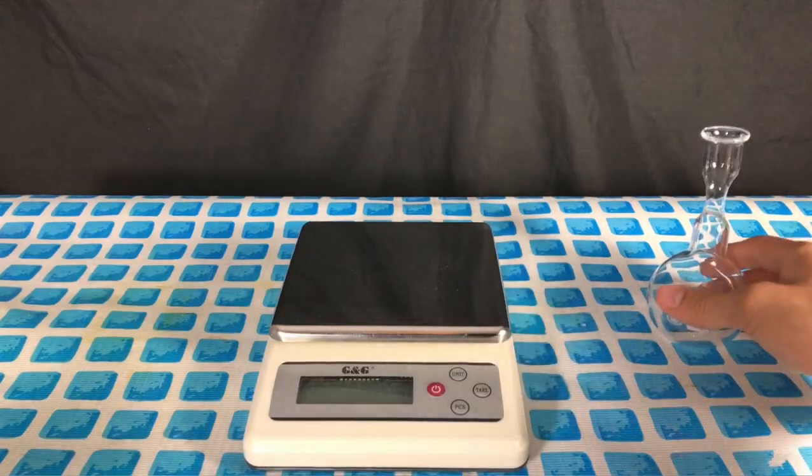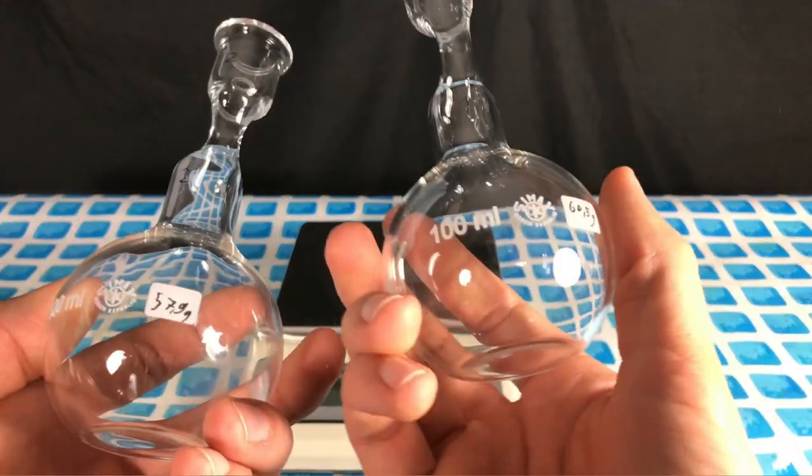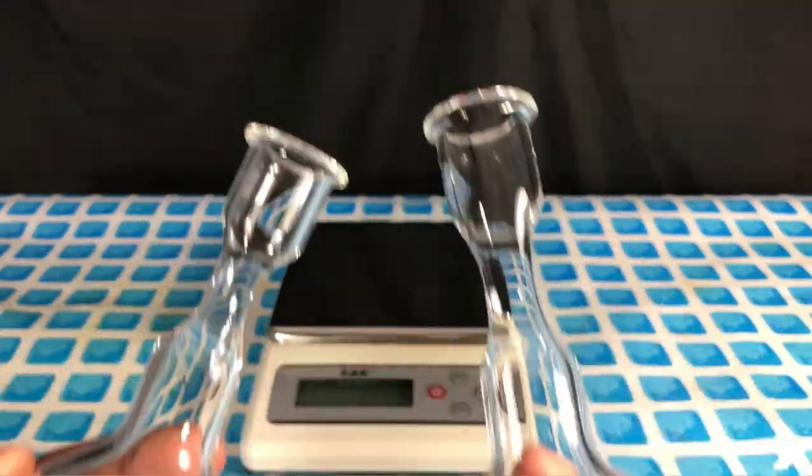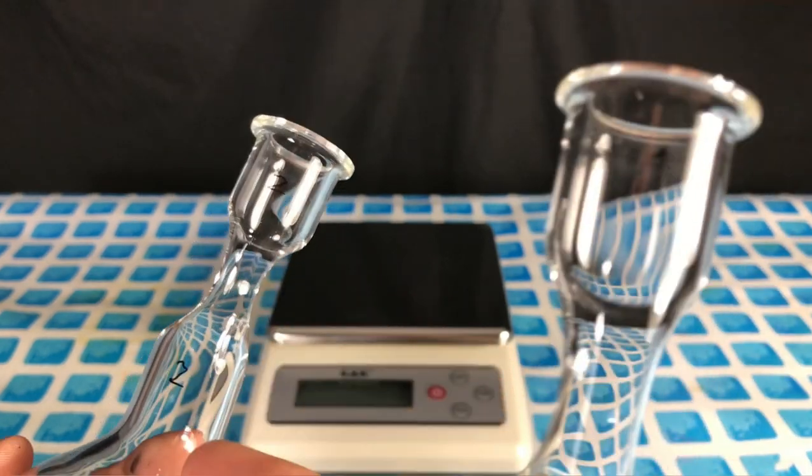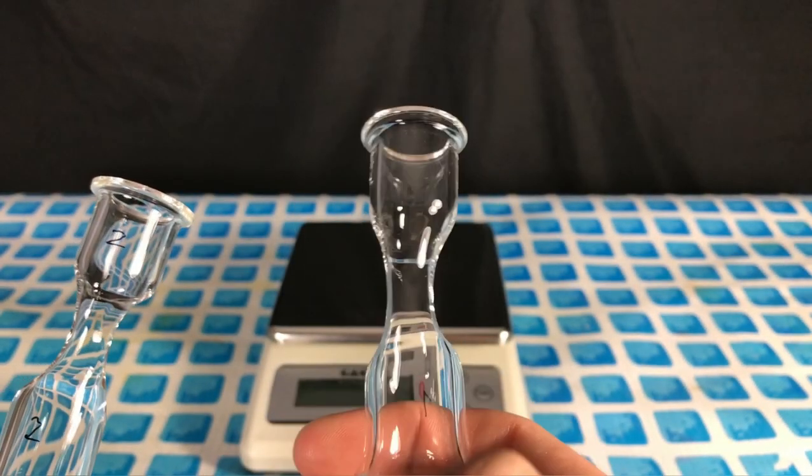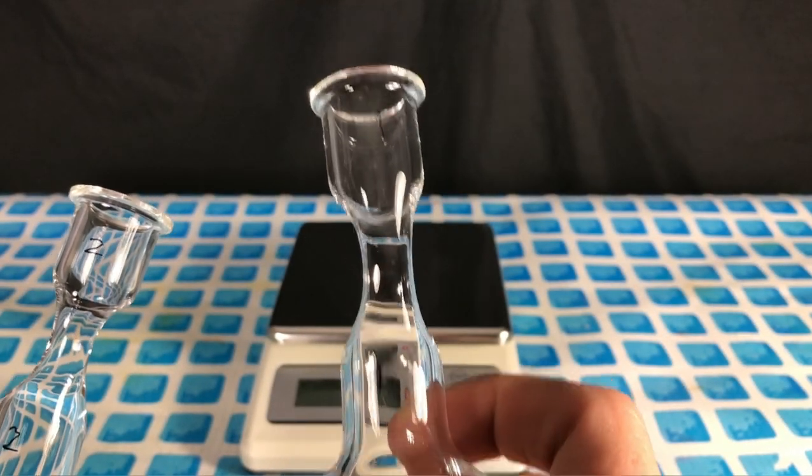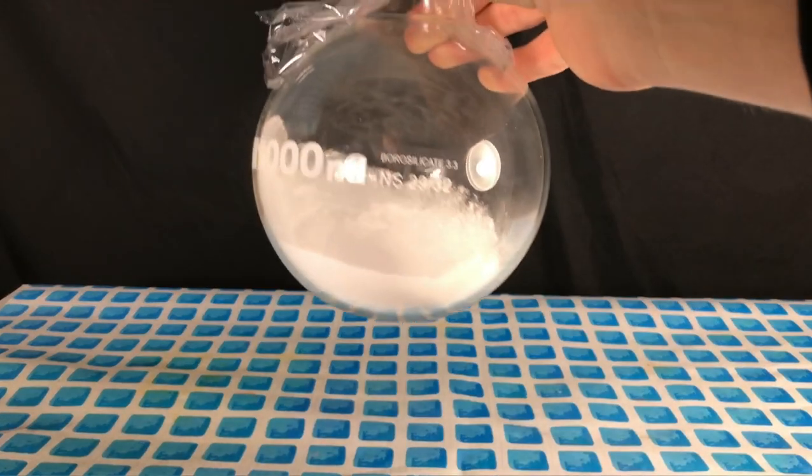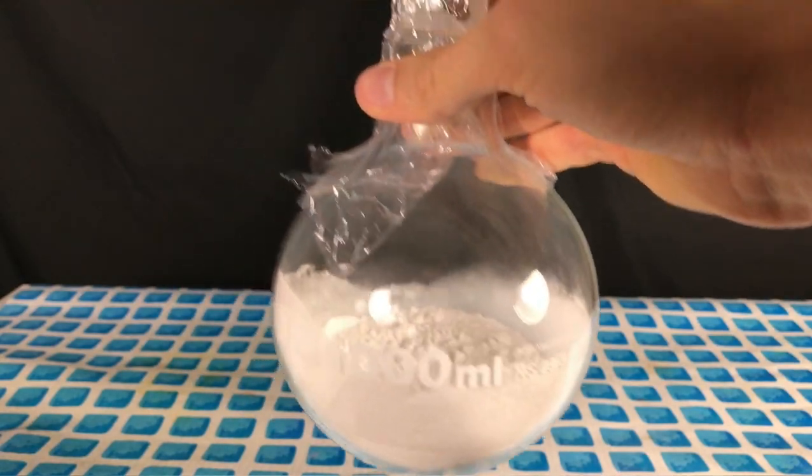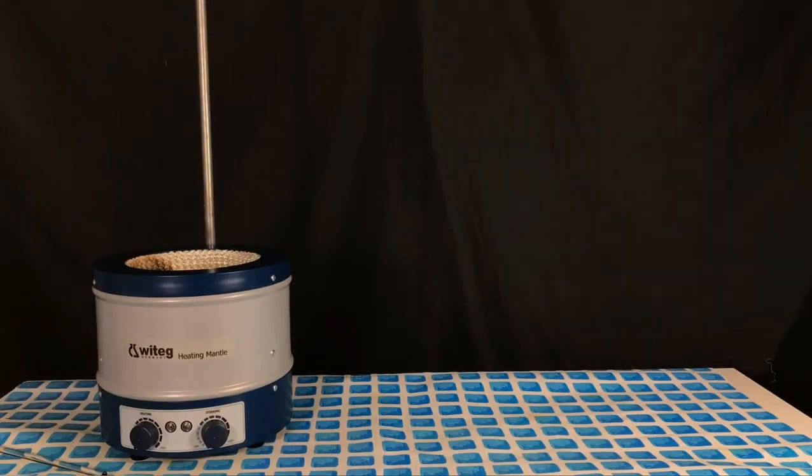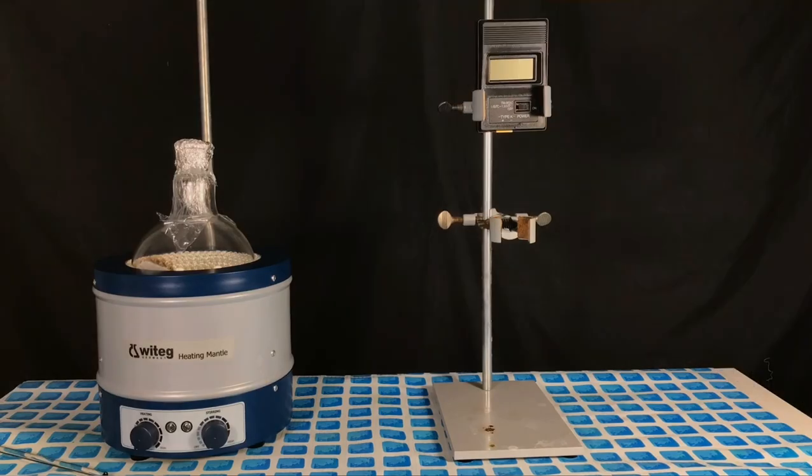Because we wanted to be able to determine the yield later on, the flasks were weighed and labeled in advance. The neck belonging to the flask was also labeled. 150 grams of phosphorus pentoxide were weighed out in advance. They were weighed out directly in this round bottom flask. Then we started with apparatus assembly.